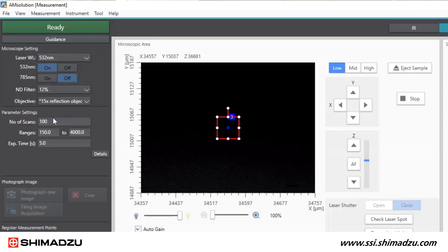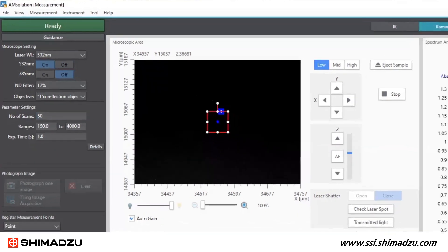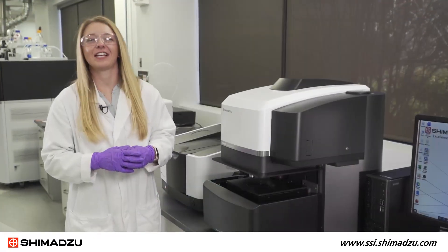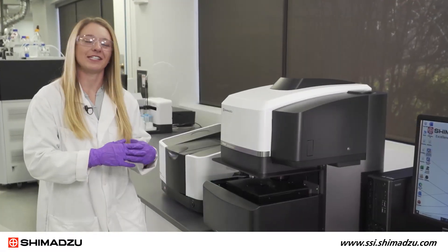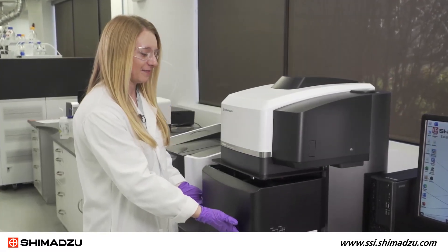Stepping down to the parameter settings tile, I need to set the number of scans. 50 scans is a good starting point for microplastics. If the data looks a little noisy, we can always increase this later. Next is to set the wave number range. The wave number range for a 532 nanometer laser is 150 to 4000 wavenumbers, so I will use that whole range. An exposure time of one second is a good starting place for microplastics. I need to first close the light shielding cover by pressing up on the shield until it clicks.